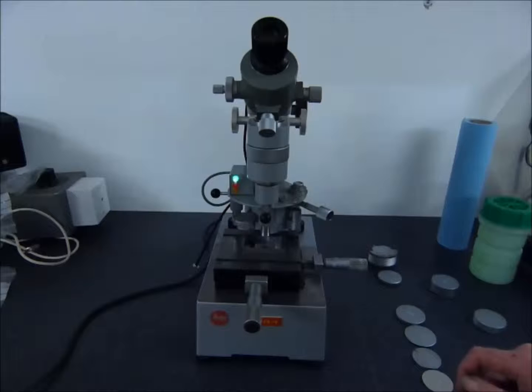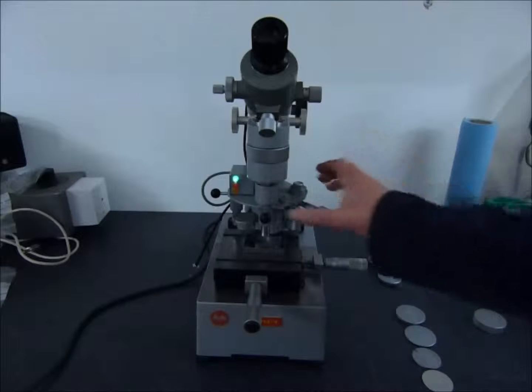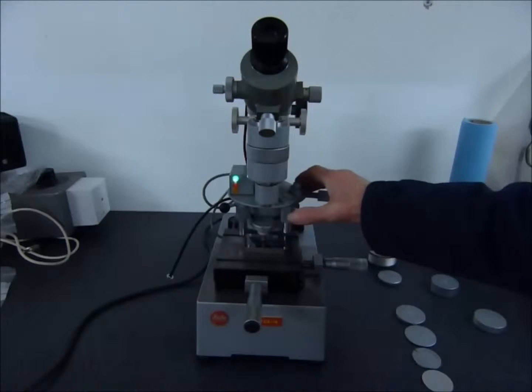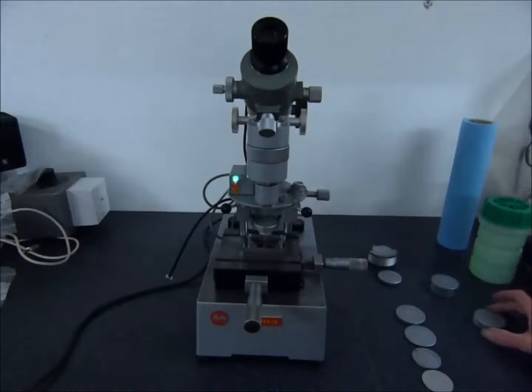You select the low power objective. Looking through the eyepiece you then look for a clear area on your sample. Then we rotate the carriage until the indenter is in position.